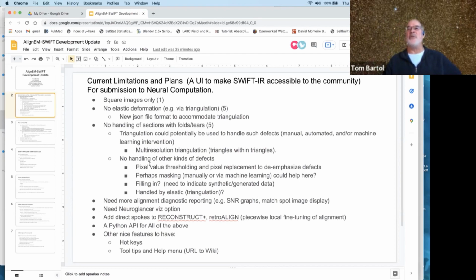Those new files are named the same as the original files, and they're files in the file system, perfectly good TIFF or JPEG or whatever image format. In the ZAR format, your images are inside this container, and they're not immediately accessible as plain JPEGs or TIFFs, not directly, right?